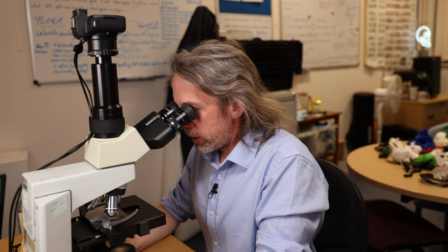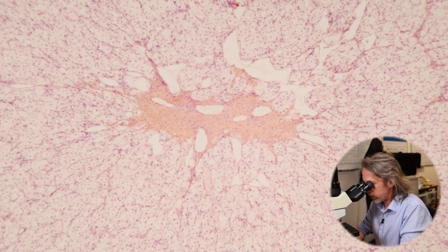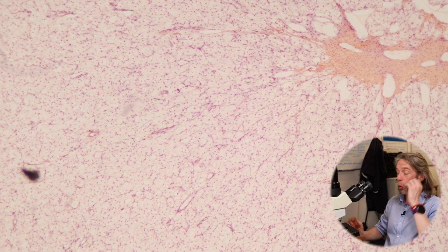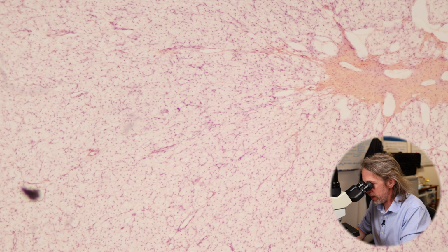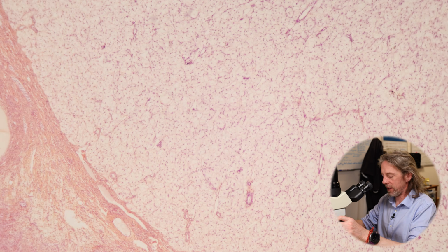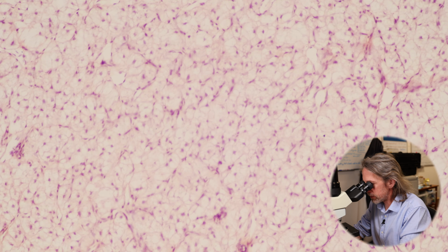What on earth are we looking at here? Well, there have been quite some changes. You can see that the granulosa cells have changed. So the corpus luteum, luteum refers to yellow in Latin. So in the ovary, this looks like a yellow body. So corpus, body, lutein, yellow. So this is a yellow body. Those granulosa cells, well, they look quite different now, don't they?